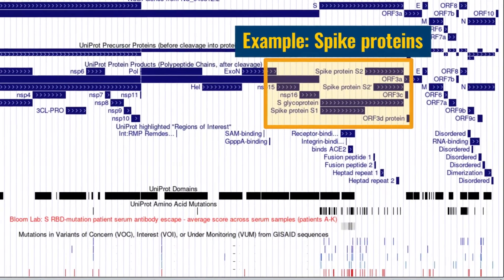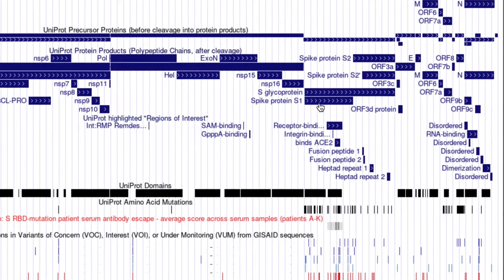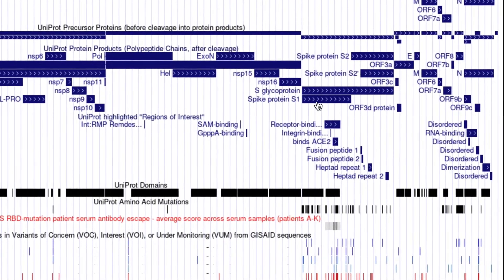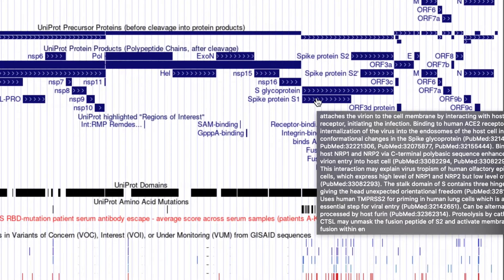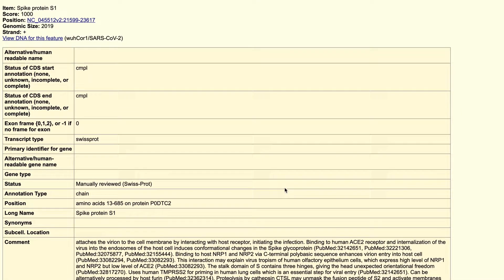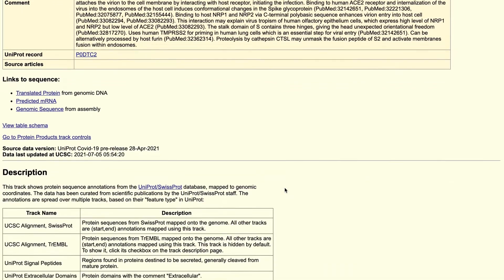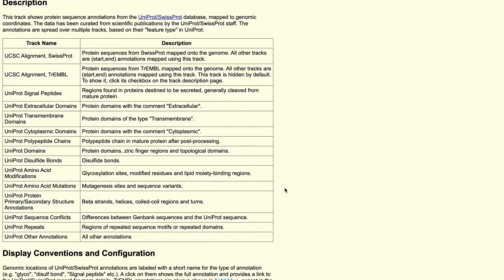If you hover over an item, you will see a descriptive name. Clicking on the item takes you to a details page, which gives you even more information, including a reference to the source article in the literature.